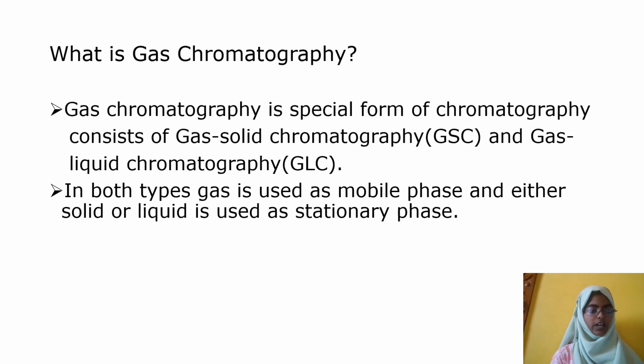In both types, that is, in gas solid chromatography and in gas liquid chromatography, gas is used as the mobile phase and either solid or liquid is used as the stationary phase.